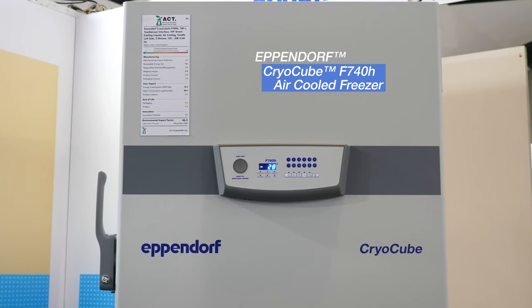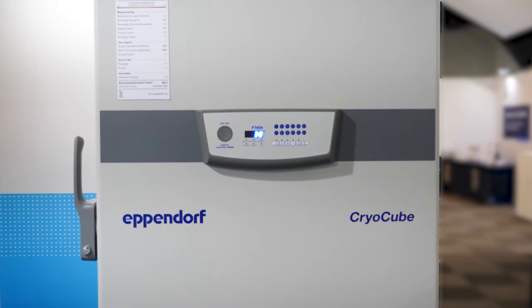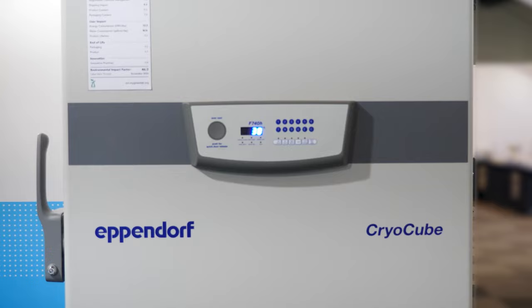Why would you select a CryoCube F740H for your laboratory? The CryoCube F740H is part of our F740 family, so there are different versions available for this freezer. This unit has a volume of 740 liters and you can store up to 576 boxes in this freezer. You have a flexible rail system, so you can adapt the inside of the freezer to your needs, to your type of racks, and every shelf can be loaded with up to 150 kg.